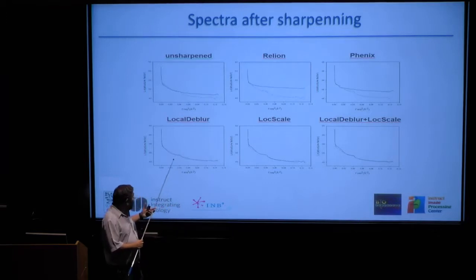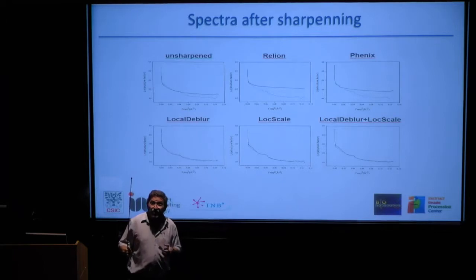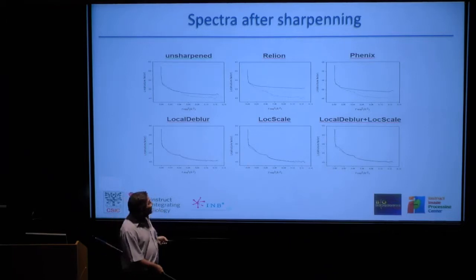But the surprising or the nice thing is that we are putting much less information and much more general information. We are not asking for any map similar to have been resolved before. For any map, we can calculate the local resolution, and from there we can proceed ahead.